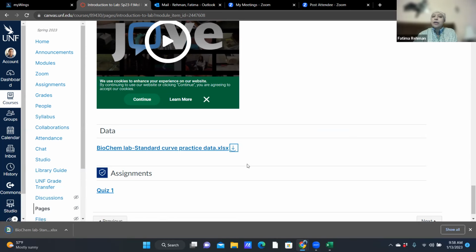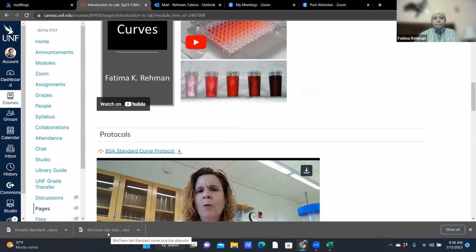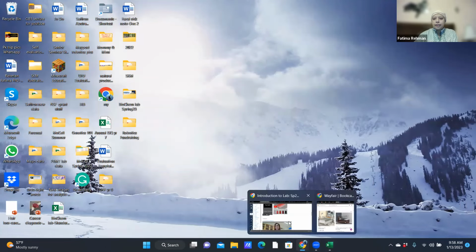So what I would like you to do at this time is to download that practice data file. And then you're also going to download the protocol, because you need the information from there for the standard curve. So go ahead at this time and do that. I'm going to bring this down. No, not bring this down yet. Is everyone good? Everyone got it so far?